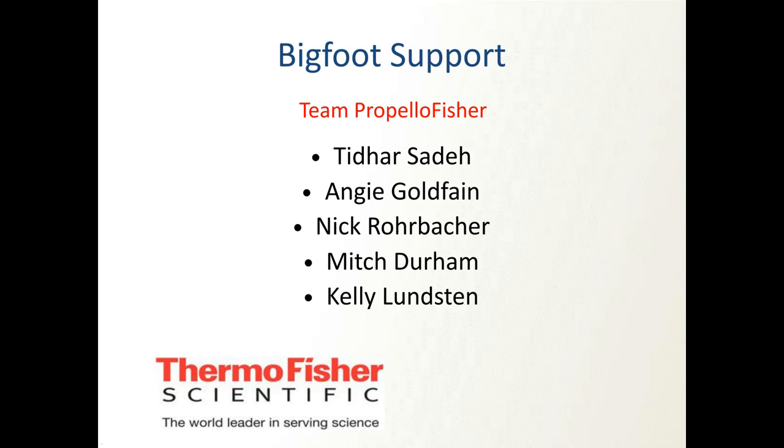No one can deny beads are the way easier control. They're bright and they'll bind whatever antibody. The use of a biological control isn't always possible. Some epitopes just aren't expressed at a high enough level to give you a good unmixing. They're going to be either too few or too bright at the higher levels. And you can't just swap reagents, because the tandems aren't exactly the same. That really becomes obvious in spectral space.